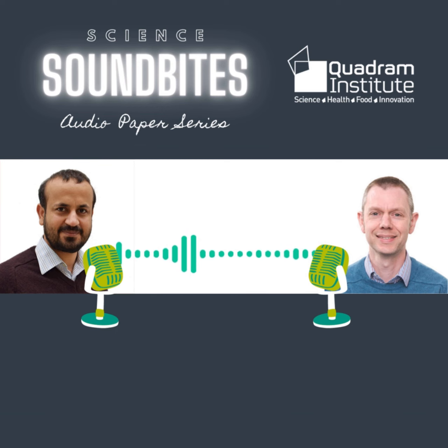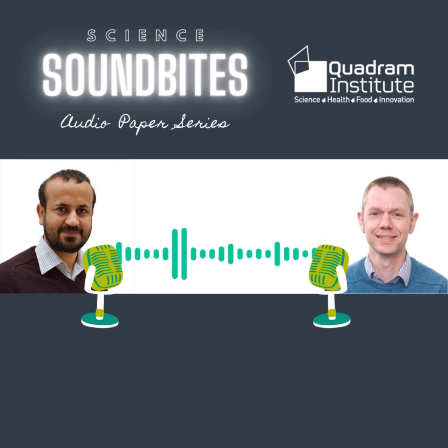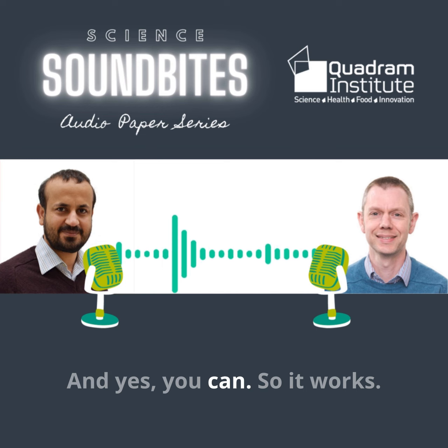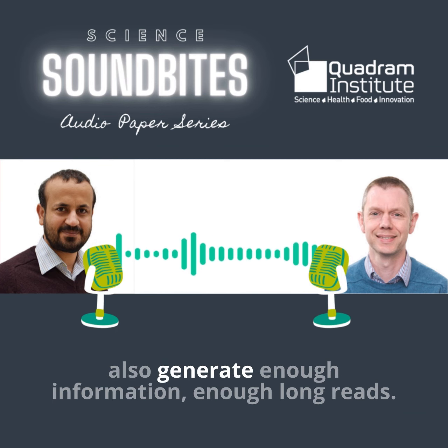Cool. So what was the major finding of this study or this method? So a few things really. The first thing was, does it work? Can you do it? And yes, you can. So it works. You can map long reads. I mean that's conceptually no surprise really, but we showed that you can. You can also generate enough information, enough long reads.